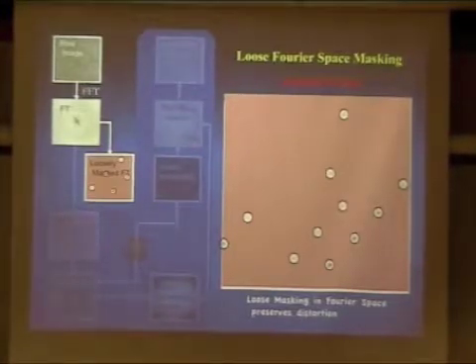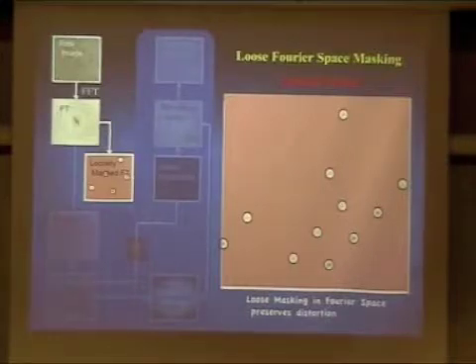Now the other part I was talking about: you need to keep the distortion information in order to make a correction. To do that, we create a mask that's a bit bigger. In other words, not only the frequency corresponding to a perfect lattice goes through, but also information around that frequency. Say two molecules are separated by exactly your unit cell.